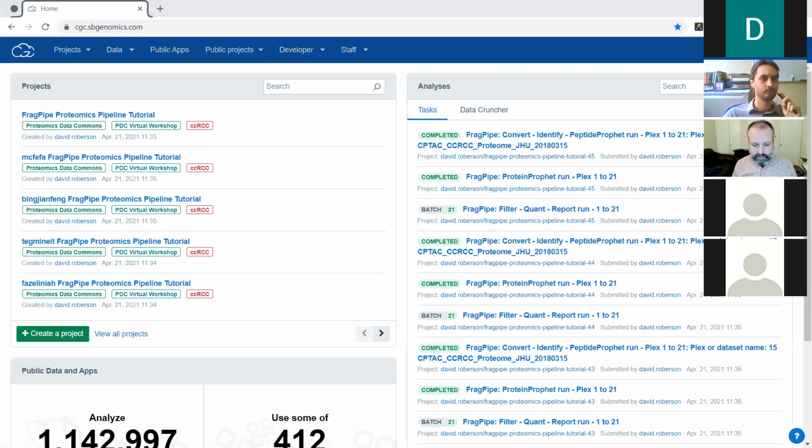Let's go ahead. Just doing a time check here. Let's go ahead and review our individual webinar projects, and then we'll run our first workflow. Okay, and then I think we're back on track. Your platform dashboard is going to be less cluttered than mine. I'm in everyone's project because I want to be able to help you out later on if needed.